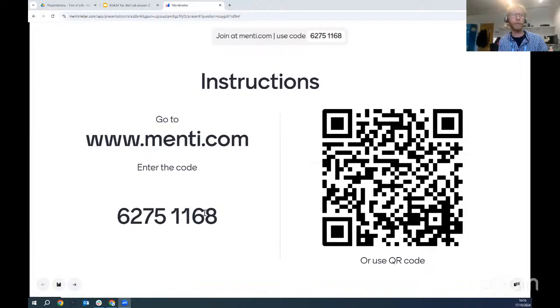We will be going through some femtos and yields of some extractions that we've done in the core lab, and I'll ask you to make a decision on how you would proceed with the sample. So I'll give you maybe a minute or so to get set up, and then we can start. Can everyone give a thumbs up once they've been able to log on, then we can go.